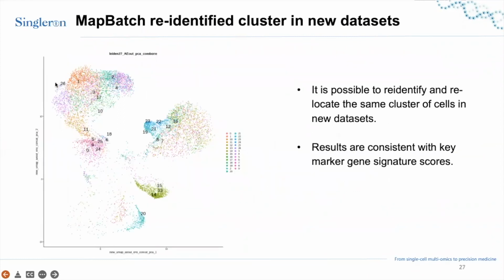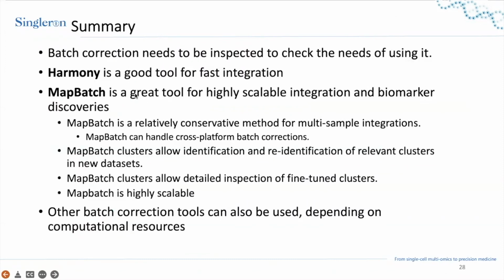Furthermore, not only can you find clusters from your data set, you can also re-identify the clusters in new data sets. When you have these clusters, it is possible to extend the method to a new data set and find a similar group of cells using the same method. So it's extendable. If you are interested, we may have a second advanced seminar where we can invite Dr. Yung himself to talk more about MapBatch, how to make good use of it, and maybe more use cases.